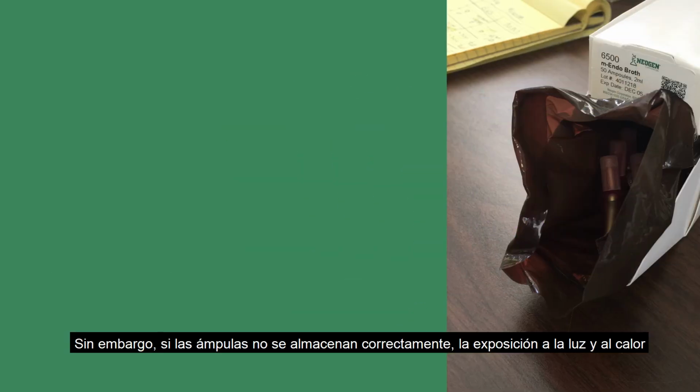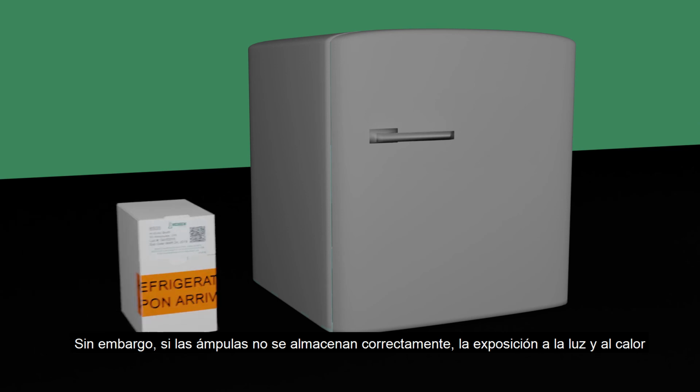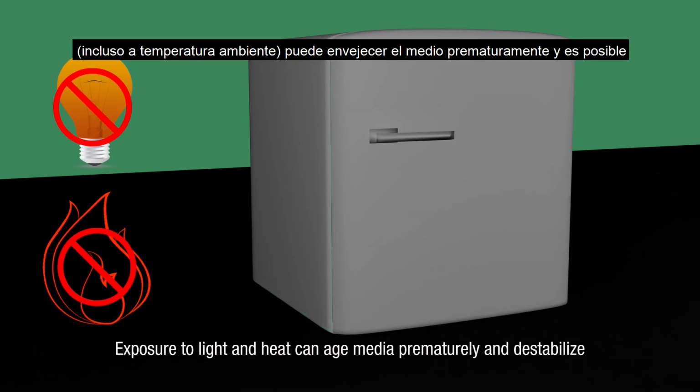However, if the ampules are not stored correctly, exposure to light and heat, even room temperature, can age the media prematurely, and it may not remain stable enough to reach its expiration date.